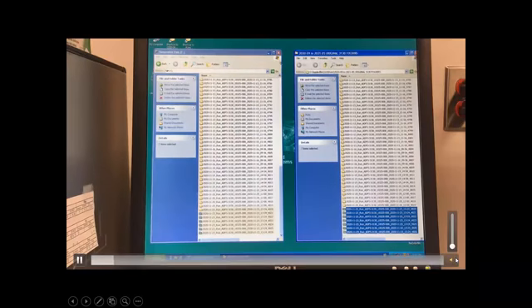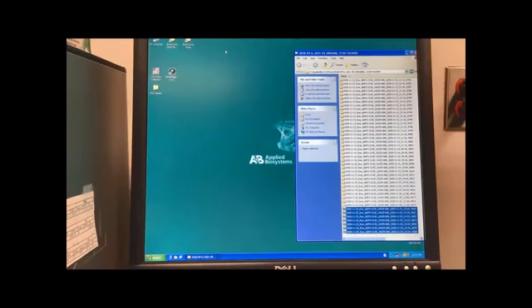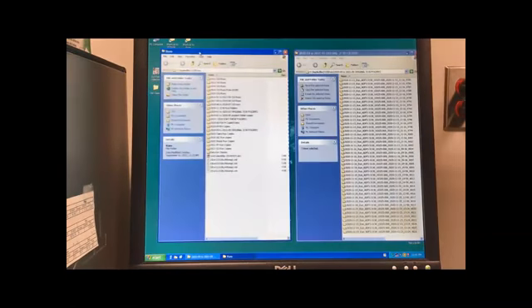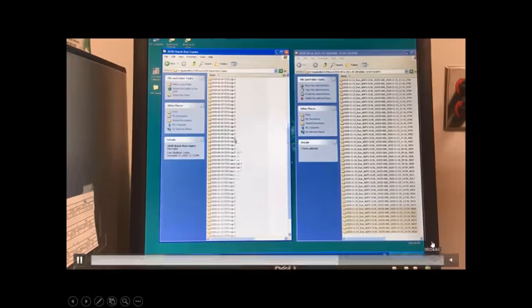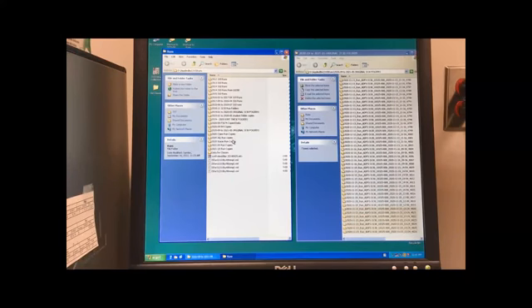All right, so we just got done copying all of our files in, including the 23rd. So I'm going to close the USB. I don't need that anymore. And now I'm going to open up this other shortcut to the runs folder. I'm going to have pretty much the same thing open, except instead of that original 3130 folder, I'm going to open up one that goes to my name. I'm going to go back here a little bit and pause really quickly. All right, so what I want you to notice is what I have opened over here is this folder.